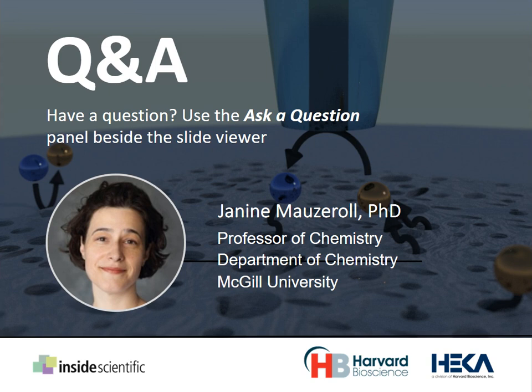Other options too is to use micropipettes in combination with ICP-OES, inductively coupled optical emission spectrometry. And so there it's not SECM per se, but you're collecting the solution and sending it to the ICP afterwards. So it's a complicated question, and it requires the development of a specialized probe for you to do it.